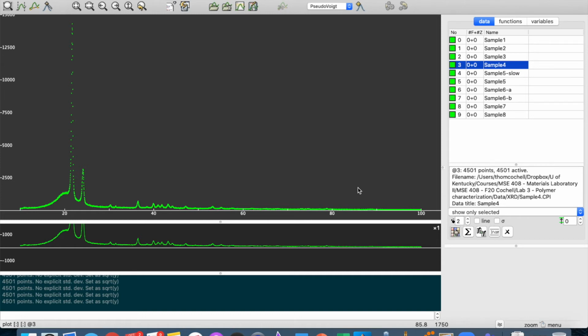The other part here is that in the XRD lab, we showed you how to index cubic materials using that technique that used a spreadsheet and so forth. For polymers, this isn't something we can normally do. So we can't rely on indexing these patterns and using some kind of procedure to determine the structure. What we're going to have to do is our normal peak fitting procedure, and make observations about the state of the polymer, how crystalline it is.